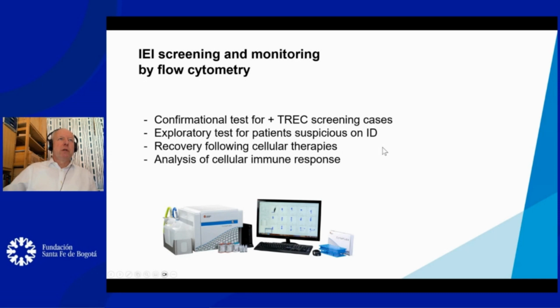Furthermore, we use the IEI screening also for the monitoring of patients treated with immunosuppressive drugs. We cover the follow-up of cellular therapies, and we analyze the cellular immune response in children with immunosuppression.